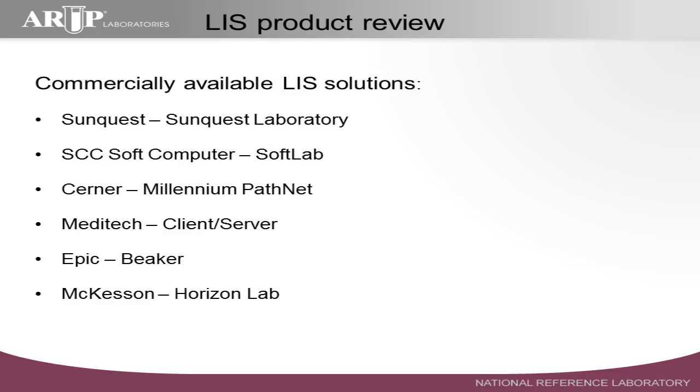So I have both the vendor's name on the left side and the name of their product there after the dash. I've mentioned before, ARUP uses Cerner Millennium PathNet, and before we installed Millennium PathNet, we operated on their PathNet Classic LIS for 23 years. So we've been a long time Cerner client.